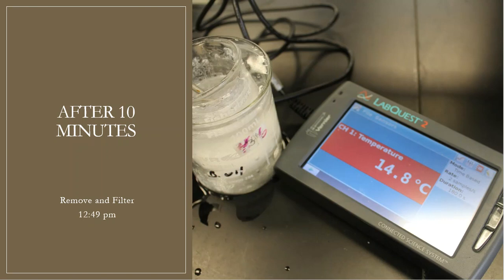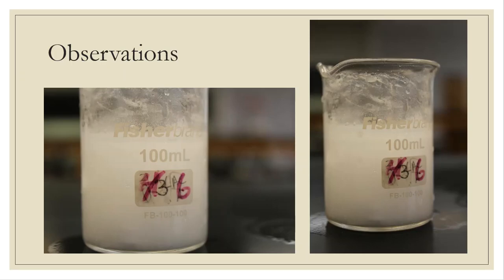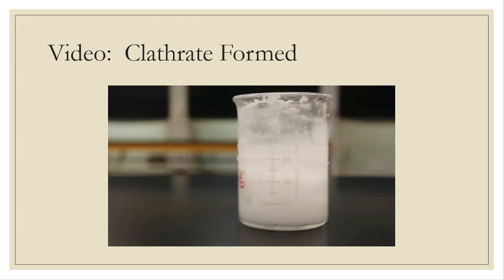So I took it out and let it rest onto the lab bench. And here's the observations after the ice bath is finished. You can make your observations here, write them down into a lab notebook if you need them, but from that picture you can clearly explain what has happened at this point. In addition to that, I also have a video as well. So let me play that.